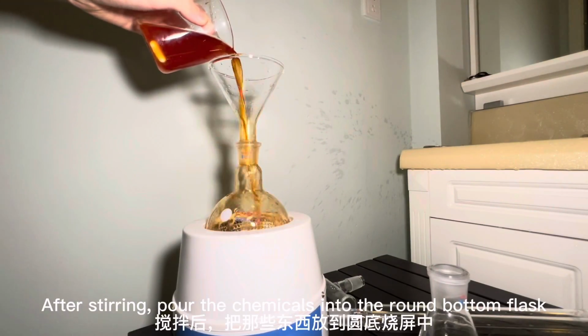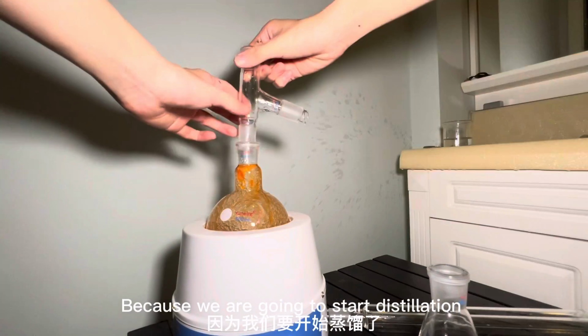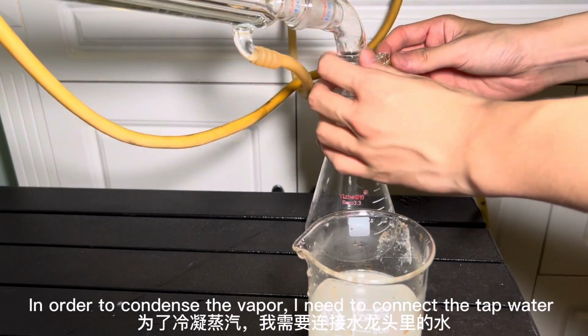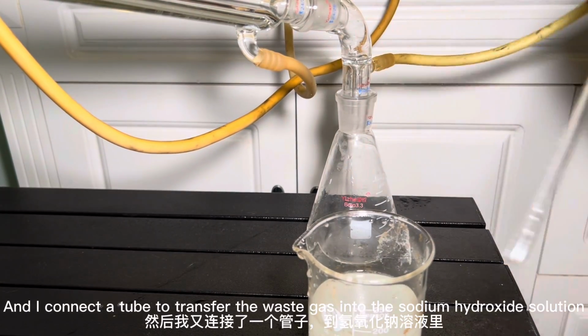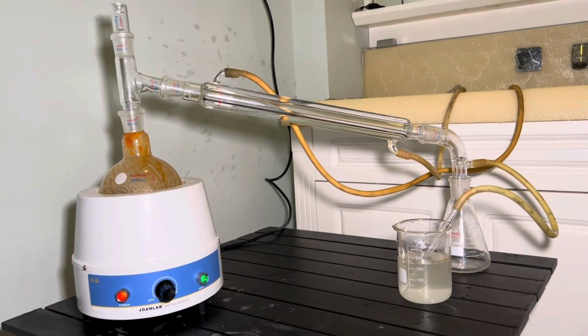After stirring, pour the chemicals into the round bottom flask because we are going to start distillation. In order to condense the vapor, I need to connect to the tap water. And I connect the tube to transfer the waste gas into the sodium hydroxide solution. Now turn on the heat and let it work.